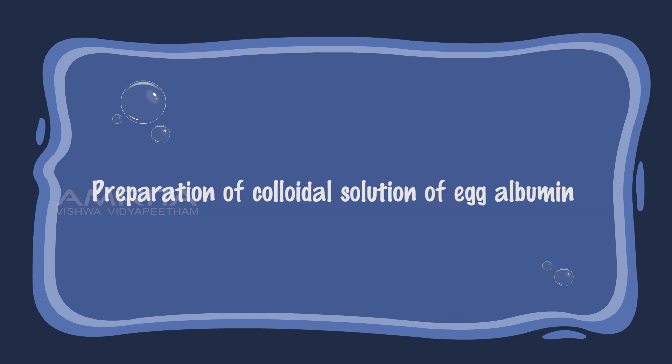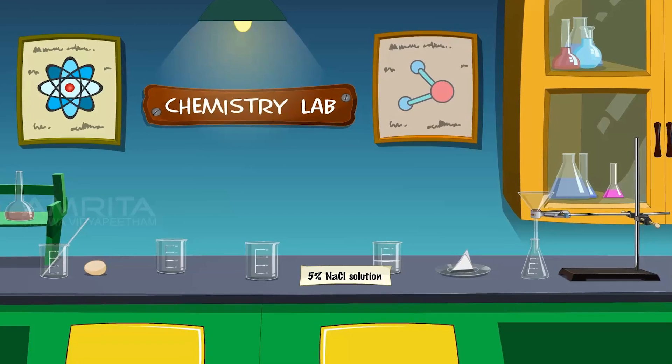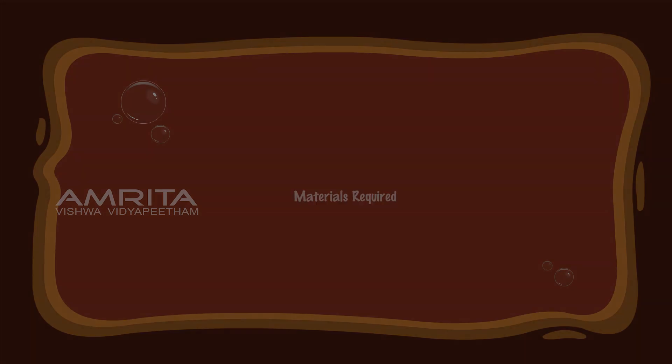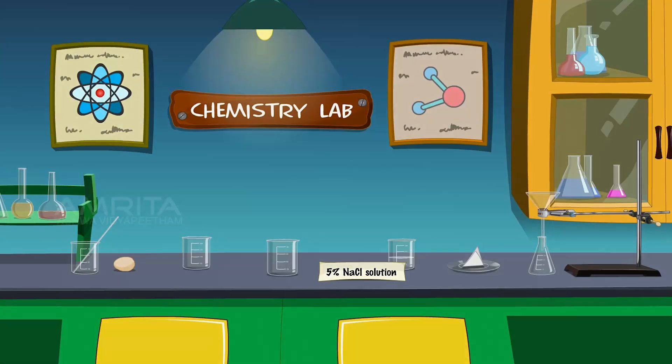Preparation of colloidal solution of egg albumin. Materials required: We require an egg, beakers, glass rod, 5% sodium chloride solution, filter paper, funnel, conical flask, and iron stand with clamp.